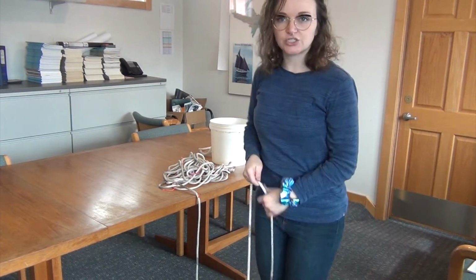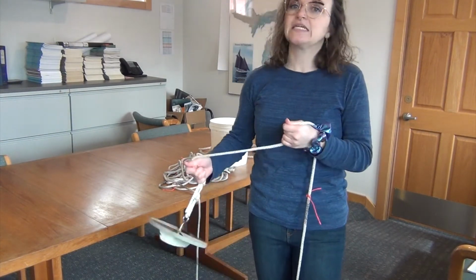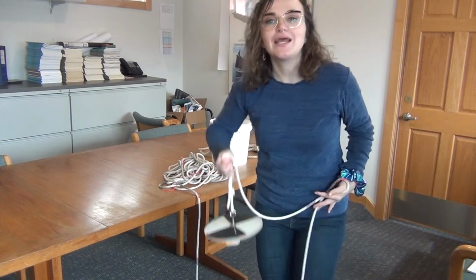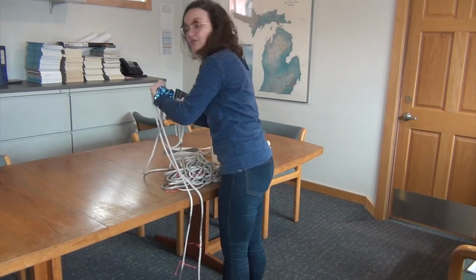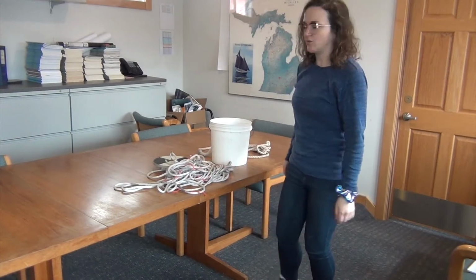Once you're finished, the students are going to pull it back over the boat. Make sure to be extra careful not to bang these into the side of the boat. Our captain and crew don't super love that. So just be respectful of the equipment, pull it up over the side, and then we're just going to make sure that this is contained over here for now. Again, make especially sure that we're not tangling this line anywhere.